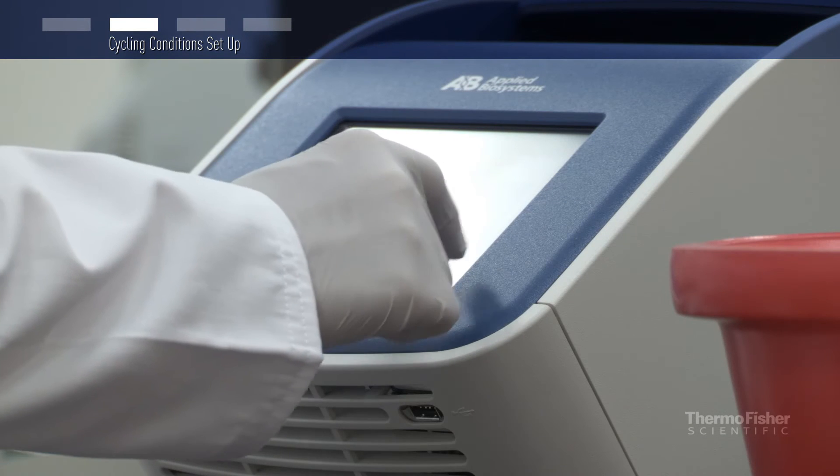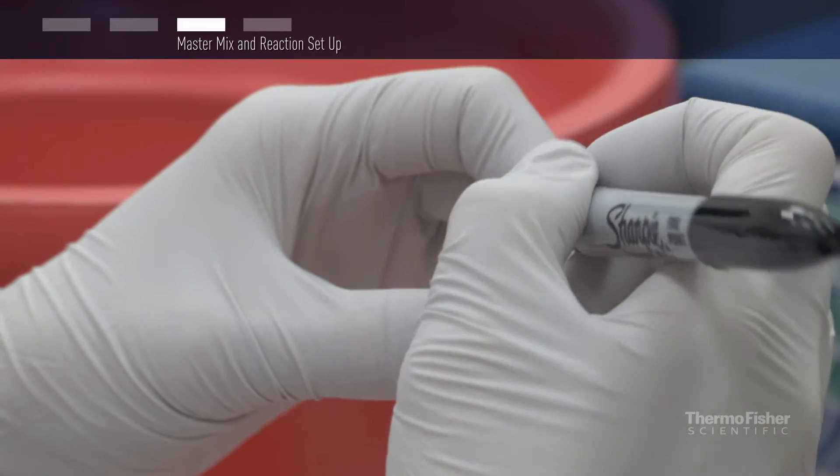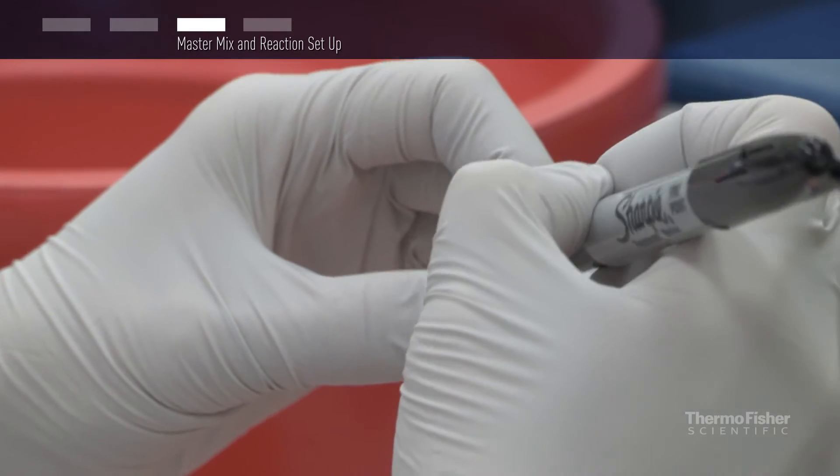We will now program the thermal cycler. Now that the cycling conditions are entered into the cycler, we can set up the PCR reaction.